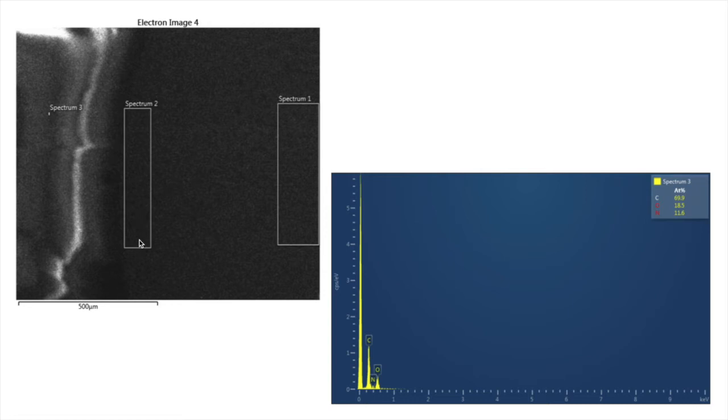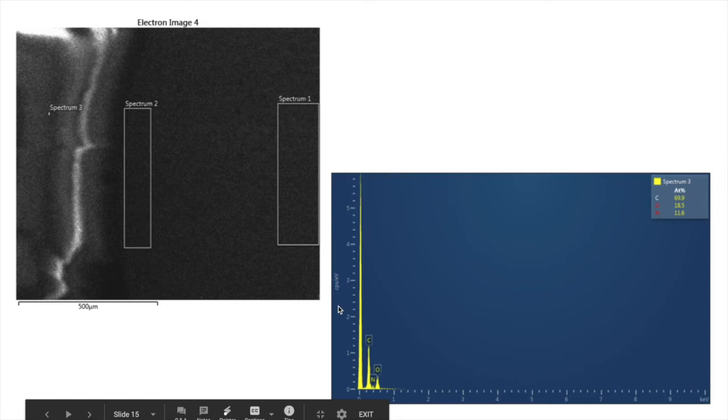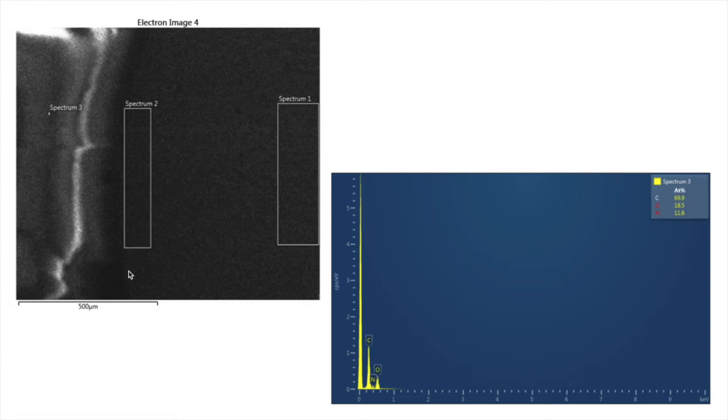So it does that in these area scans. It collects data from this whole area and then we see the spectrum. This is energy down here and this is the counts. The same results kind of occur, but the area is much larger.